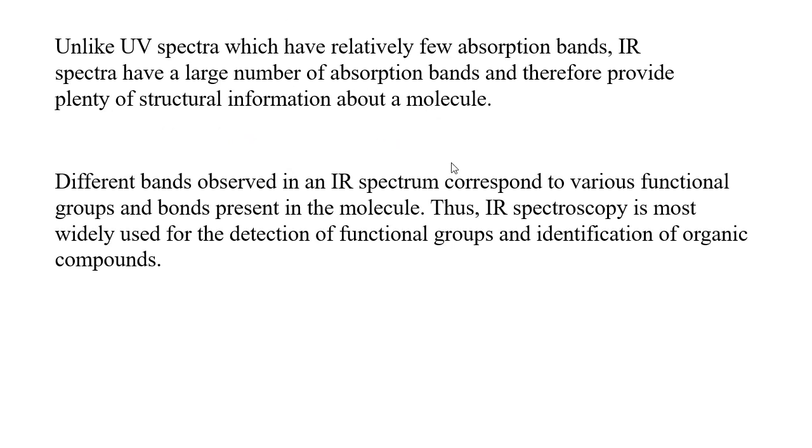Here, the different bands observed in an IR spectrum correspond to various functional groups and bonds present in the molecule. Thus, IR spectra are most widely used for the detection of functional groups and the identification of organic compounds.